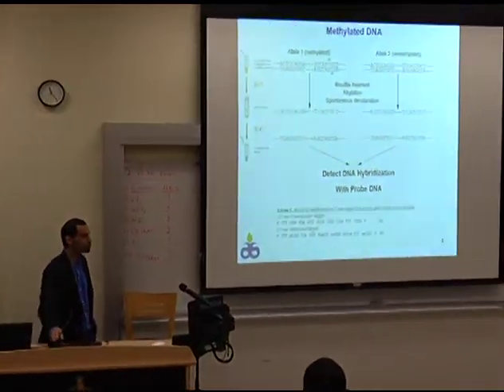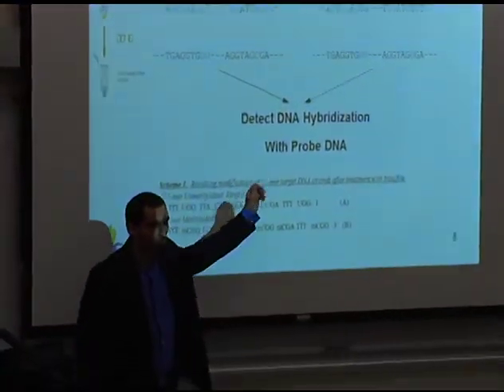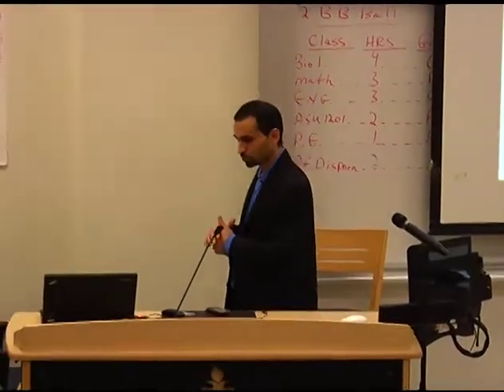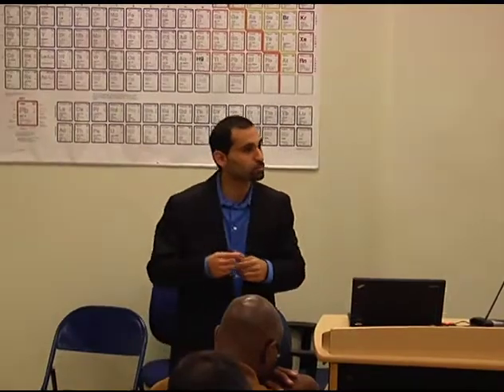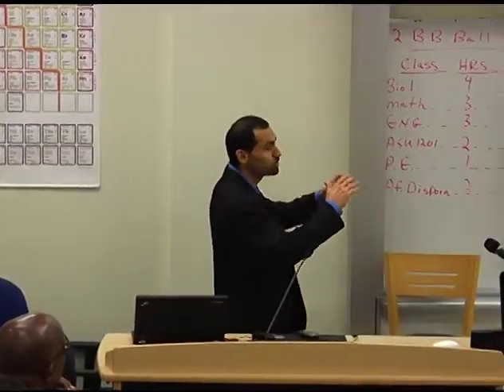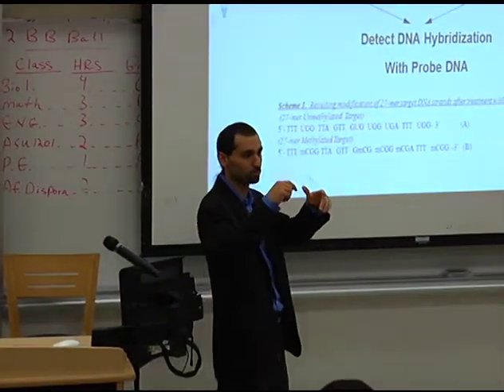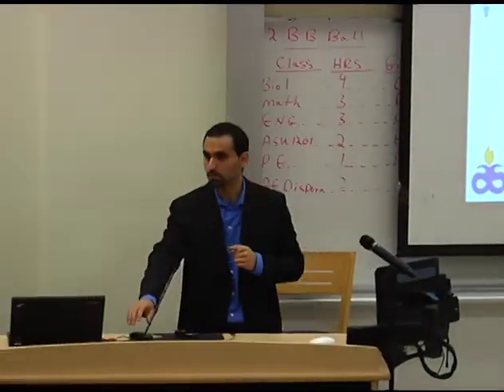So that's just for any DNA sequence. We've already shown you can detect any DNA sequence using that technique with macro and micro electrodes. Now we wanted to show that you could actually detect whether or not it was methylated. Now remember, methylation is on the epigenetic level. That means the DNA sequence is literally the same. The only difference is it has that methyl group, that methyl group at the 5' position of cytosine.